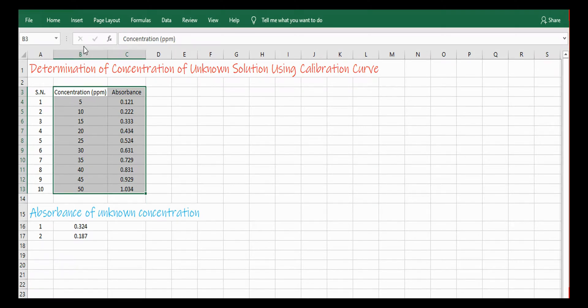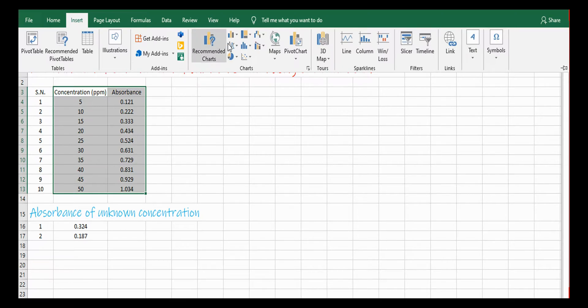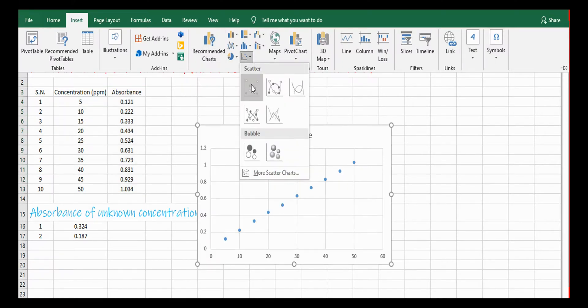Now select these two columns of different concentration and their corresponding absorbance value. Then go to Insert, and then go to Chart and select Scatter.